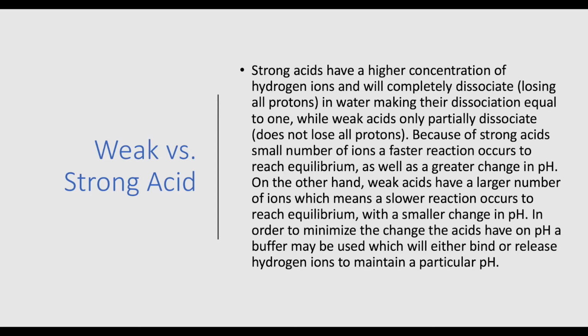In order to minimize the change that acids have on a pH, a buffer may be used, which will either bind or release hydrogen ions to maintain a particular pH. In order to continue with our lab, we needed to prepare a buffer solution.